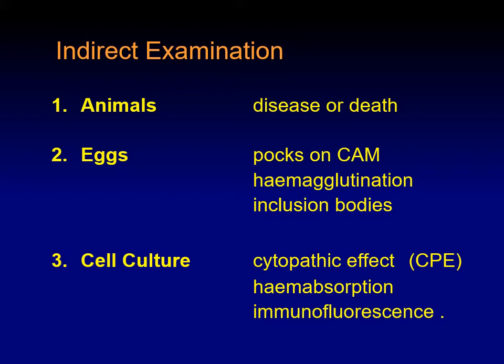And usually what they will do after that, they will dissect the animal and look for those changes which have occurred in certain organs. However, this is a very primitive way of looking into things. It's not that useful because you require quite a lot of animals, and sometimes these results could be fruitless. So somebody thought, why don't we use eggs?